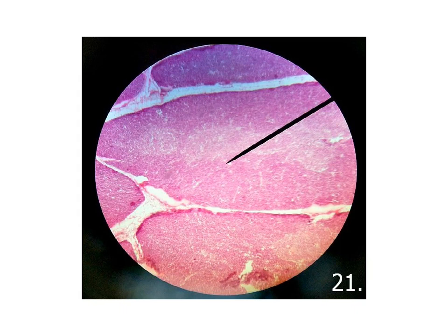If we look at this section in the thymus under the microscope, you will notice this dark periphery, which is the cortex of the thymic lobule, and the pale center, which is the medulla. Of course, this is dark because it contains a huge population of lymphoblasts and lymphocytes, and here we have fewer lymphocytes, so we have a dark periphery and a pale center. And these white areas represent the connective tissue that was damaged during preparation of the section.